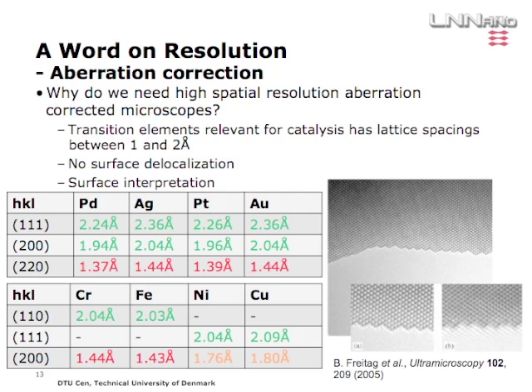But when you get down to some of the other ones, it becomes a bit more tricky. Most of the field emission microscopes are in this range, about 1.5 angstrom. When you get down to these smaller spacings, you cannot resolve them, so you need to go to the aberration corrected machines.